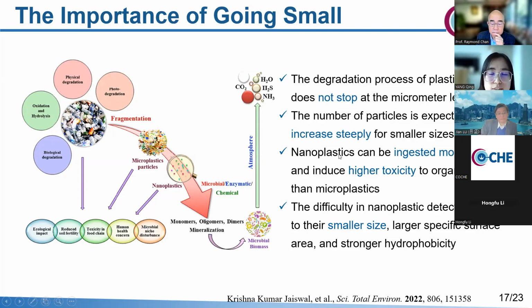But the poor sensitivity of Raman spectroscopy and the weak intrinsic signal of nanoplastics make it impossible to analyze nanoplastics using normal Raman. So SERS may be a promising method.